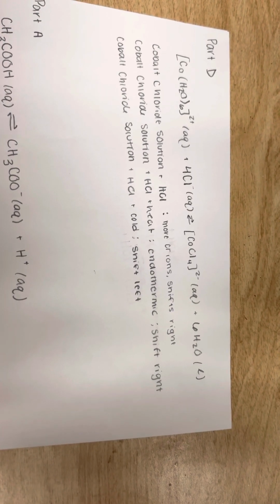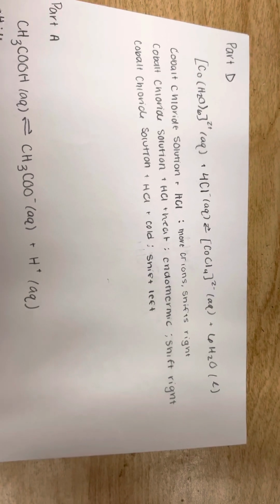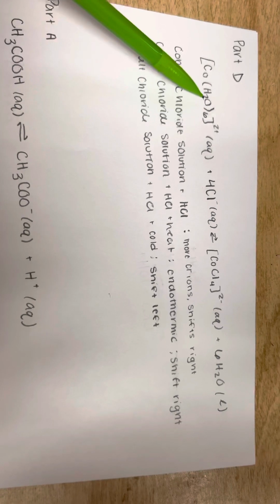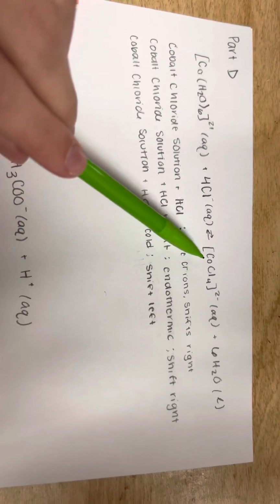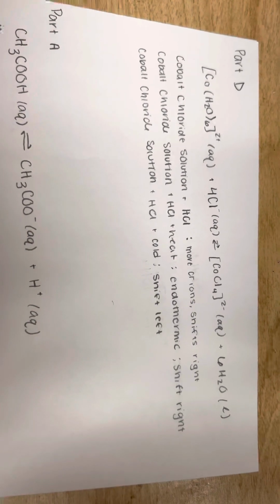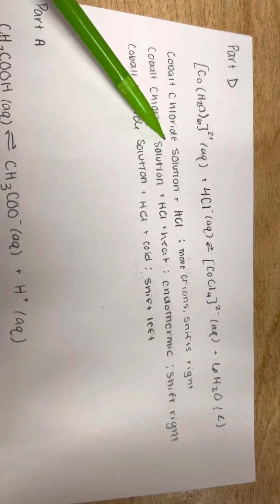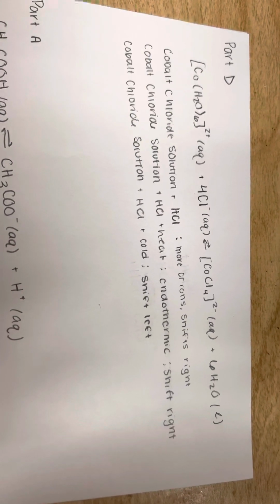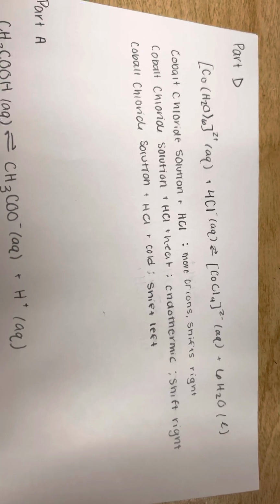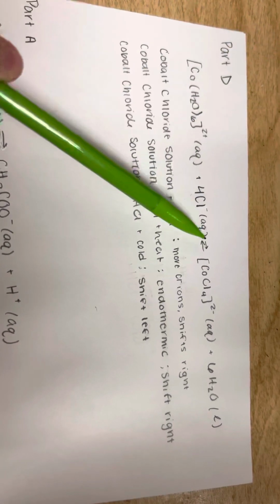For part D, we have a cobalt/cobalt chloride equilibrium. The Co(H2O)6 2+ ion is originally a pink color, while the CoCl4 2- ion is originally a blue color. So when HCl is added to the cobalt chloride solution, more Cl- ions are reacting, which causes an increase in them, which again, that's right here, which therefore causes the equilibrium to shift right.